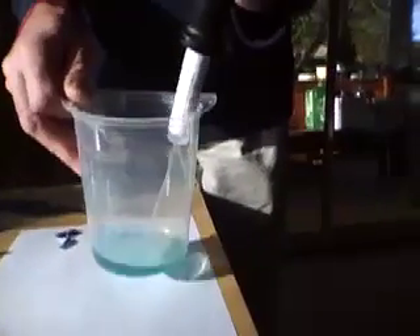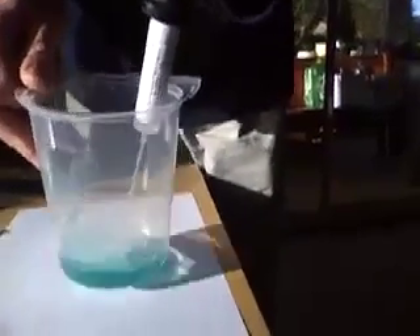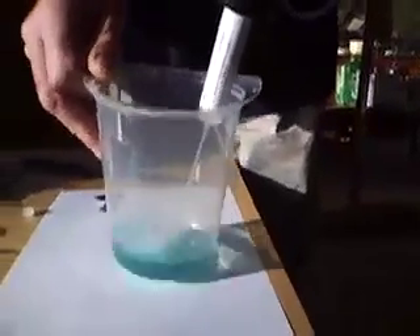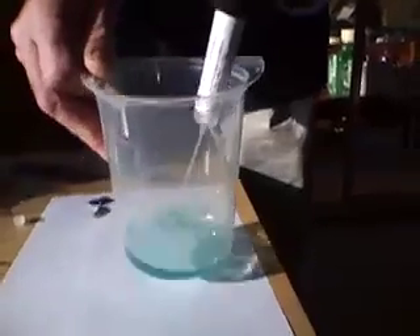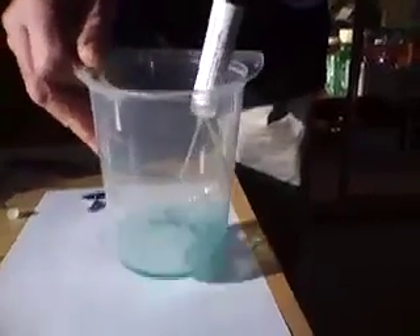Now this is going to take a little while. This isn't cave water, this is water from our kitchen tap, and you'll see as you add the acid it will gradually begin to turn pink.